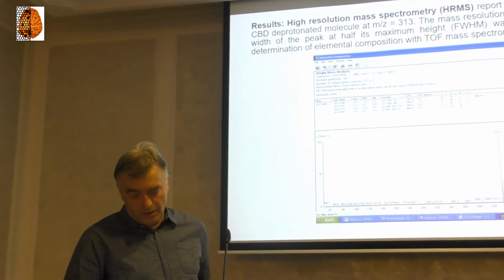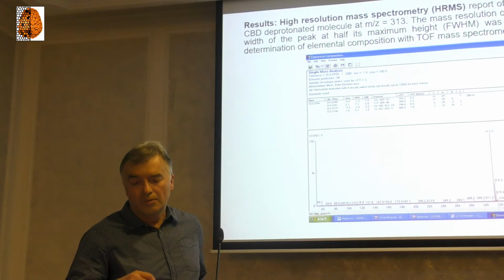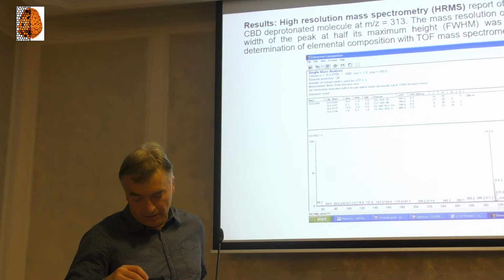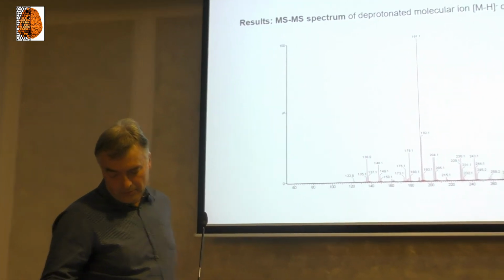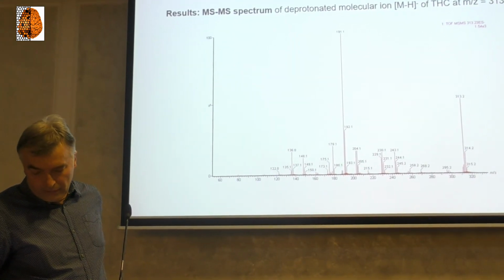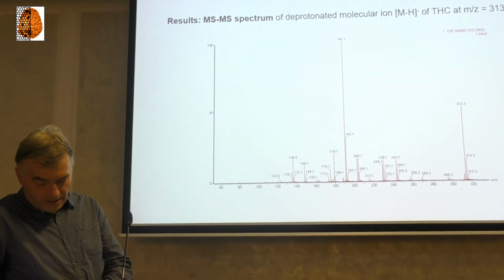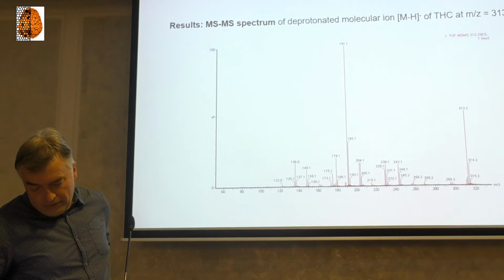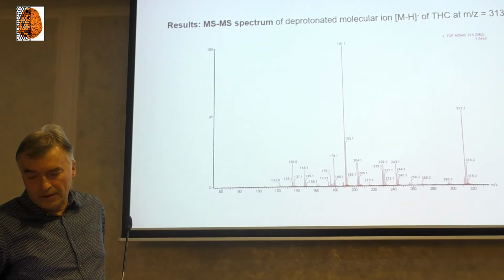The same is possible to measure for other impurities or for other compounds which are included in an LCMS chromatogram. Since hemp products are a very complex matrix, many other natural compounds can be present, and we also used MSMS measurements for further characterization of compounds in a matrix.